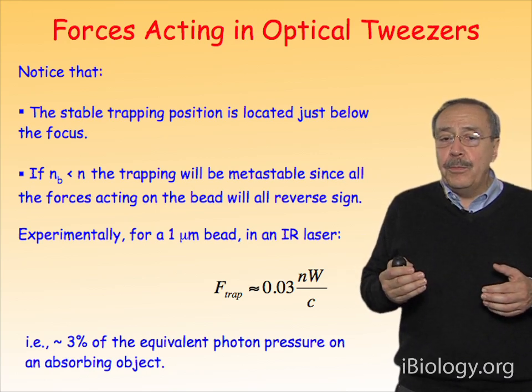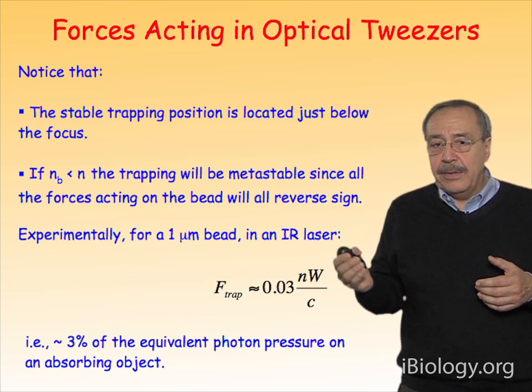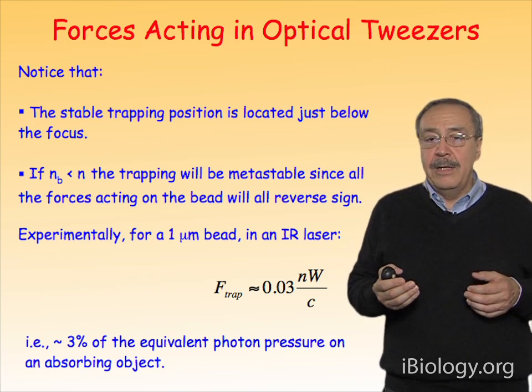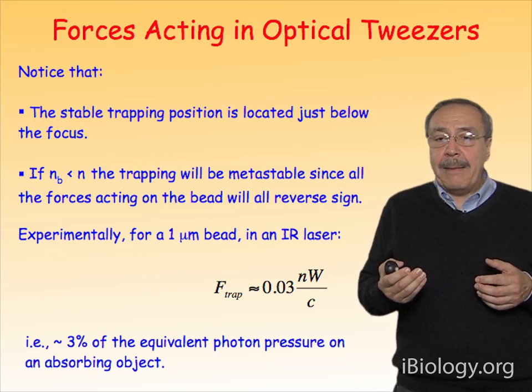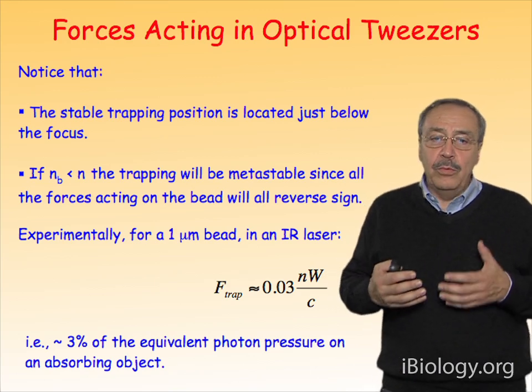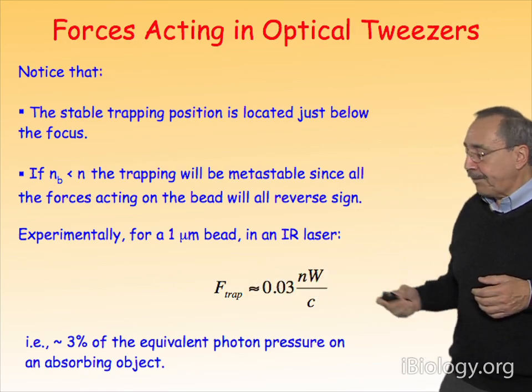Experimentally, we find that if you place a 1 micrometer bead in an infrared laser, essentially about 3% of the power of that laser actually can be converted into a trap force, as indicated here by this expression, okay?